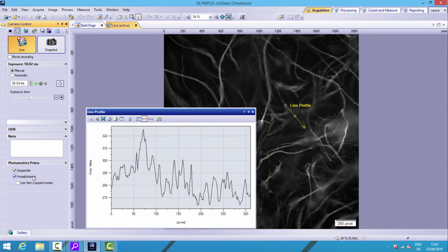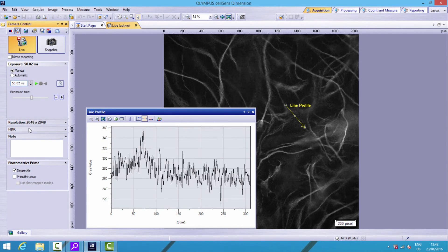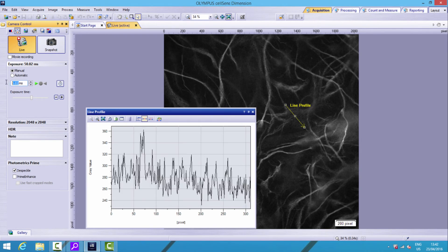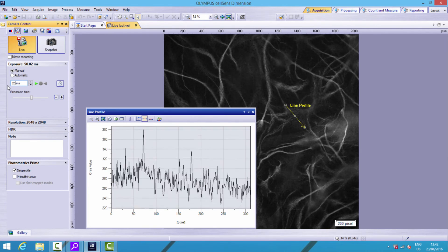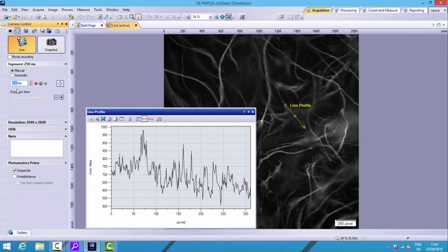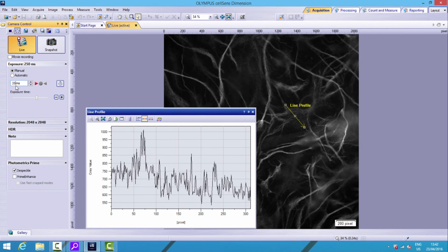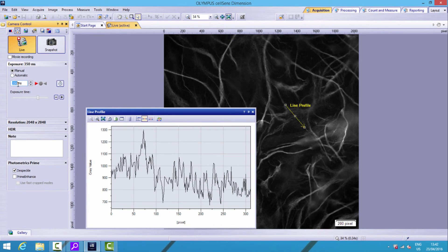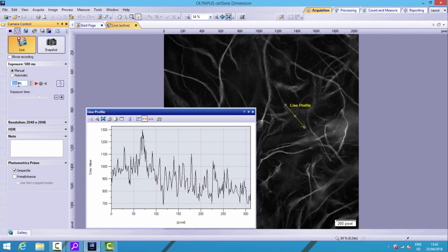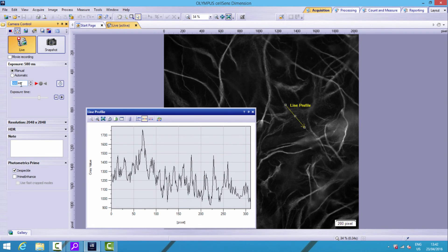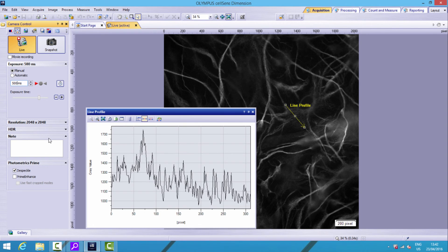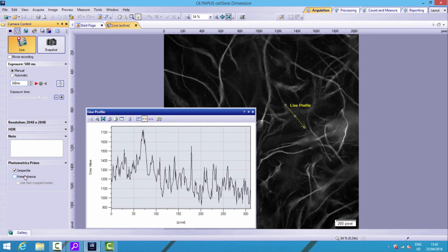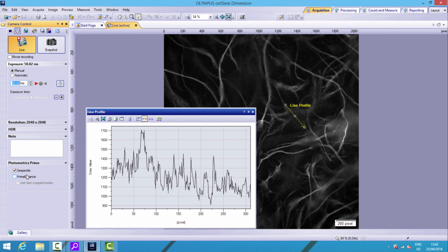Now a nice way of showing that is to go and look at what you would need to get to that. So let's try, let's try in here, maybe 250 milliseconds. Okay, so 250 milliseconds, that's nearly as good as 50 with Prime Enhance. So let's go 350 milliseconds. Again, 350 milliseconds is getting there, but you know, sometimes it takes up to 10 times the exposure times to get as good as our camera with Prime Enhance on, depending on the light level, depending where you are. But particularly in these low levels, it's really useful.